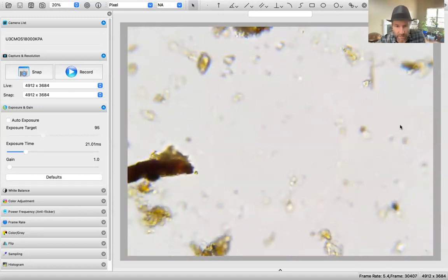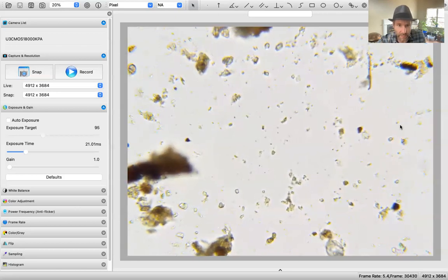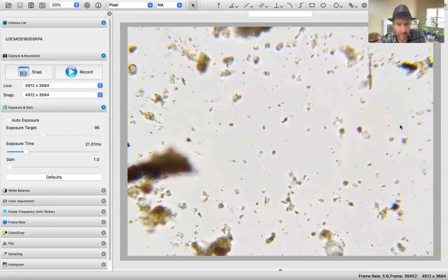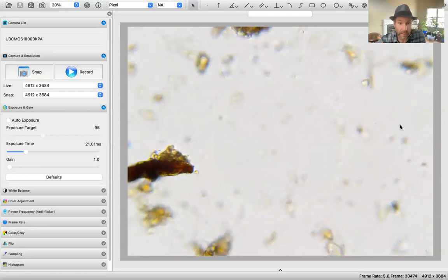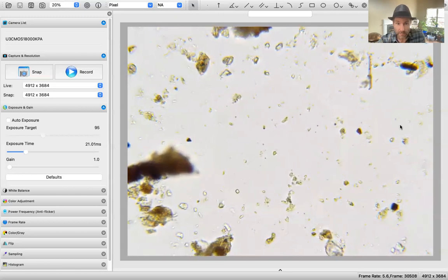I'm very sad to see that there are no flagellates in this, because there was a load of flagellates before the rainstorm that we just got, which makes me a little worried. And it got really cold. It dropped down to 20 degrees this morning for the first time this year. So that could have something to do with it.